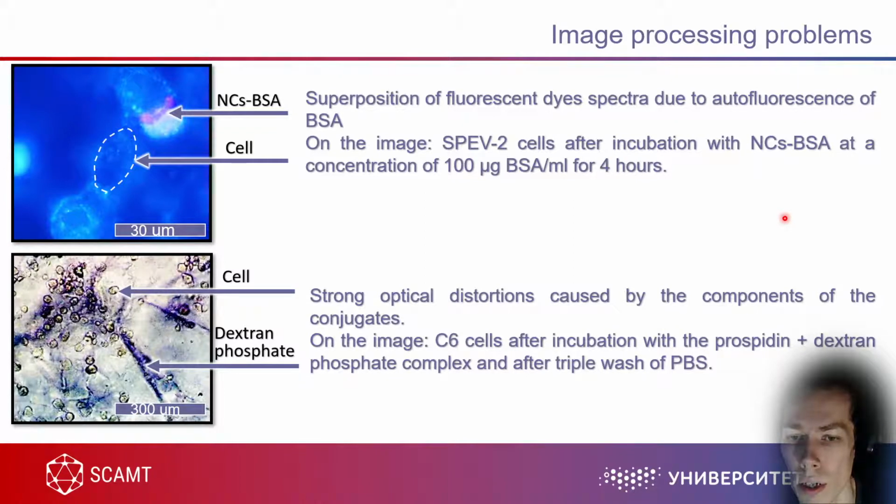For now, a lot of artificial intelligence approaches are available to process your images, but in some cases it is better to obtain some good images first, and then try artificial intelligence and machine learning approaches to get something from these images.